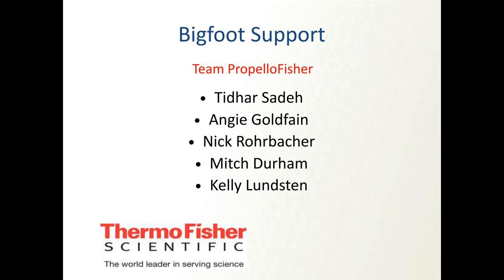Let's get started. Our first question here is, have you noticed any differences in the spectral unmixing method between the Bigfoot and the Aurora, since you have both? Okay, well, that's right to the point there. The answer is yes.